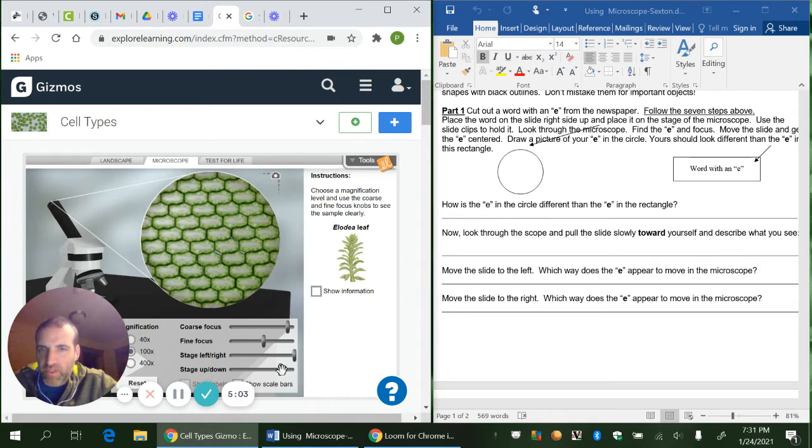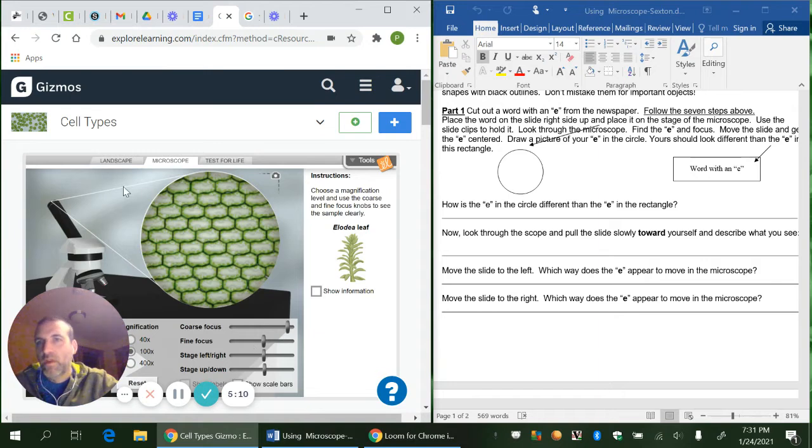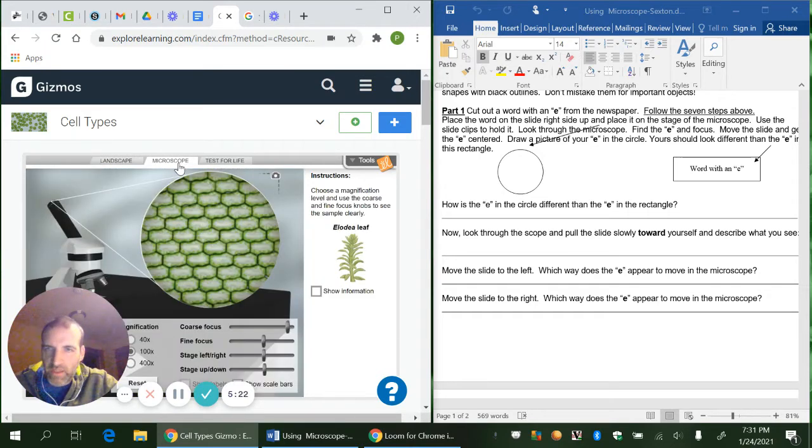So I'm able to move this slide up and down using the gizmo. And if you want to go back into that gizmo and play with this a little bit more, there's a bunch of other different stuff you can look at under the microscope that you may not have looked at when we did the gizmo. If you just want to get a little more of an idea of what a microscope can show you. So we're looking at this freshwater plant, though, called Elodea.